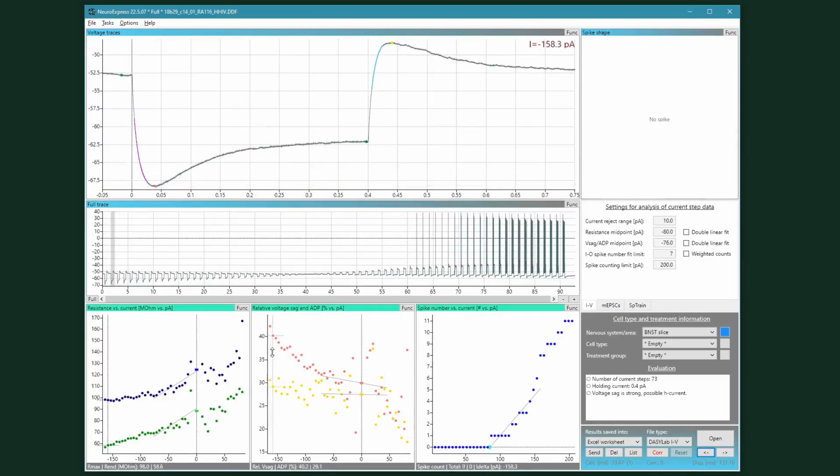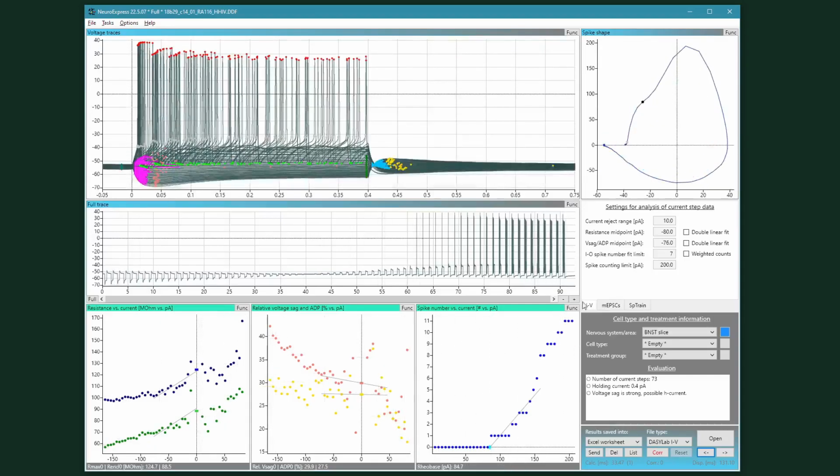Of course, there are a few other options and menus that you can use, and you will probably explore the program in detail. You can use the right mouse button to bring up the pop-up menus, and I strongly encourage potential users to explore the program using these right mouse button clicks.